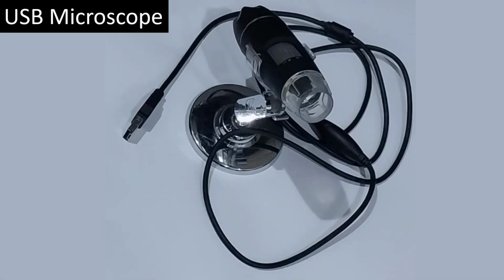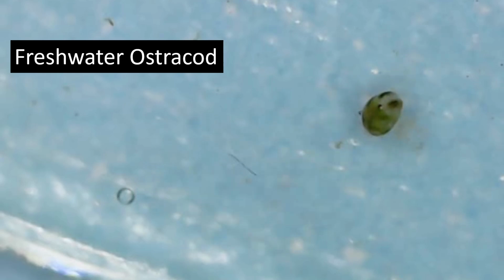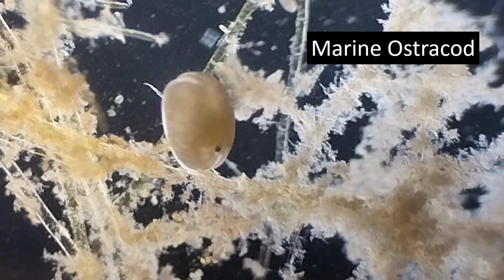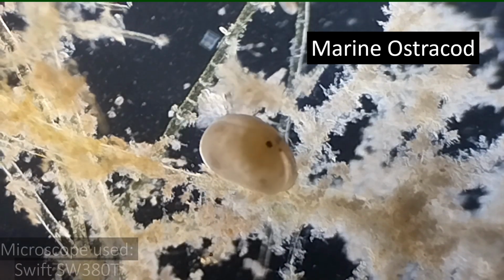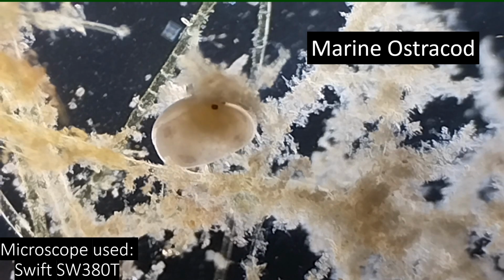But this doesn't mean that this is the first time I ever find ostracods, because I was able to film them with a USB microscope in the past. Here is what the footage looked like. Ostracods have a dark shell, but their eyes can be clearly seen using dark field illumination.